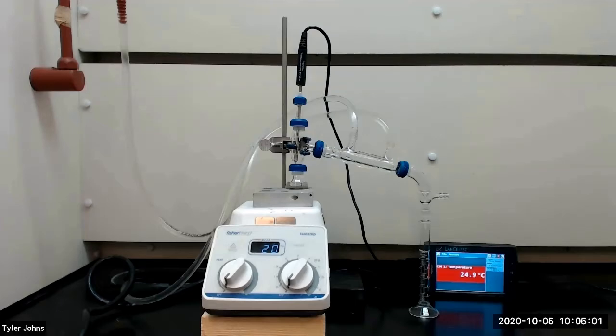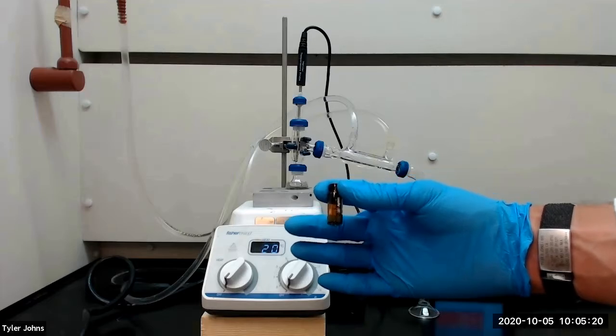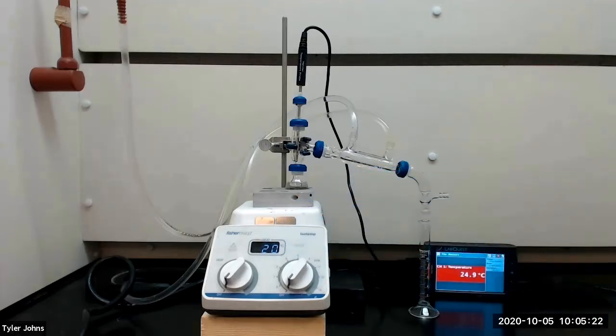Beginning at a volume of 0.5 milliliters in our 10 milliliter graduated cylinder, we will record the temperature every 0.5 milliliters. After we have collected 1 milliliter of distillate, we will remove the 10 milliliter graduated cylinder and collect the next 3 to 4 drops of distillate in a gas chromatography vial and cap tightly. We will then resume collecting the distillate in the 10 milliliter graduated cylinder.